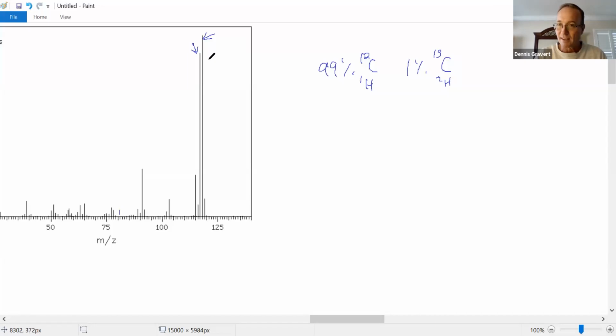What about this peak? That's a pretty big peak. Why is that such a big peak? Well, it turns out this is a fragmentation peak. Things that are less massive, smaller values, must have been pieces of the original molecule. And this is one mass unit smaller. Well, what's one mass unit? A hydrogen. So it looks like this molecule likes to release an H. As it's flying through the mass spectrometer, that radical cation kicks out probably an H radical. So the rest of the molecule is a cation with one missing hydrogen, so it has one missing mass unit.